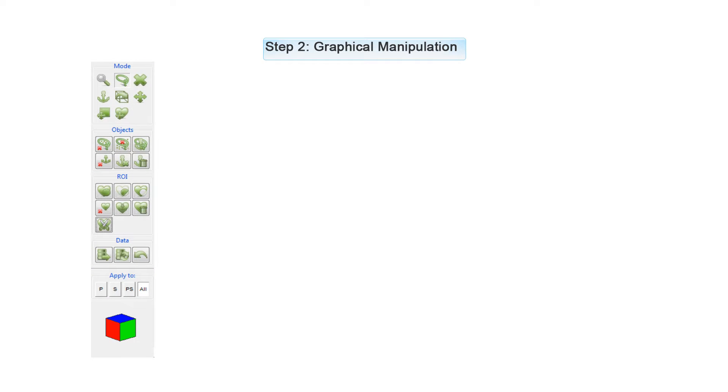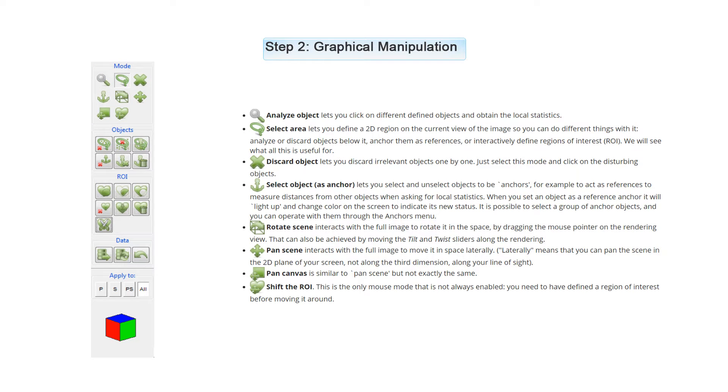In Step 2, Graphical Manipulation, you have a couple of panels. The first one is the Mode Panel, where you can select the continuous state of your mouse. Here is a list of the different modes and what they do.